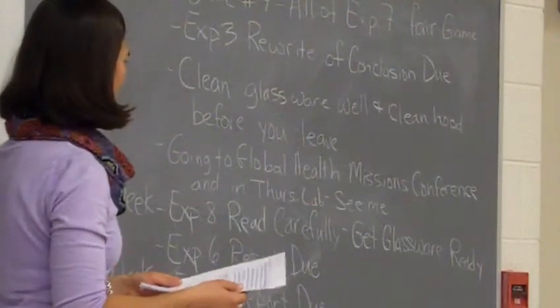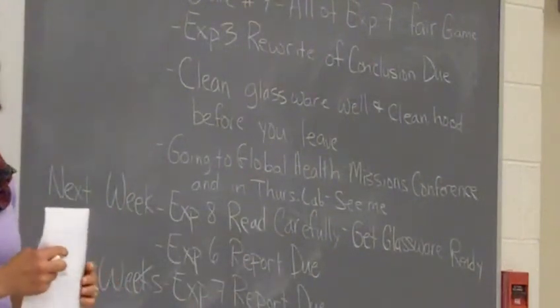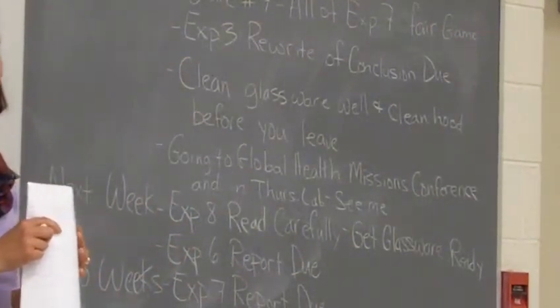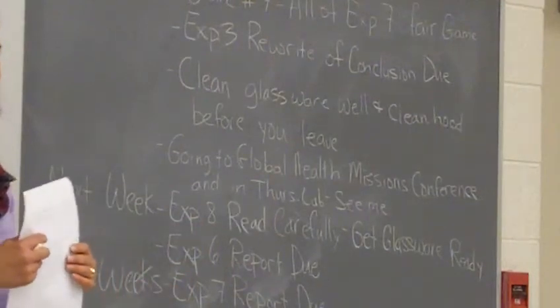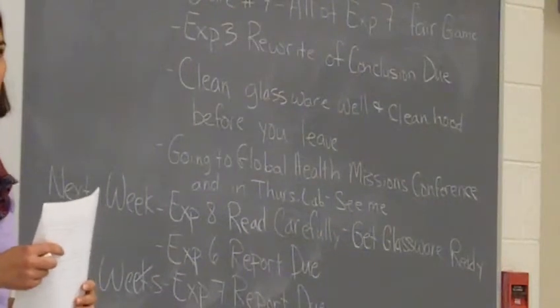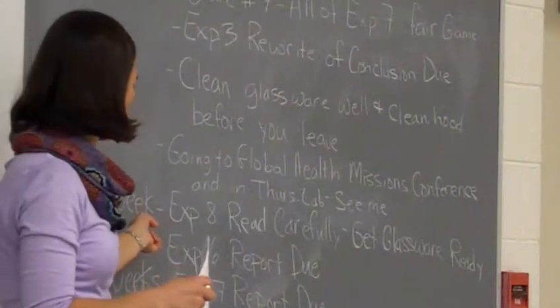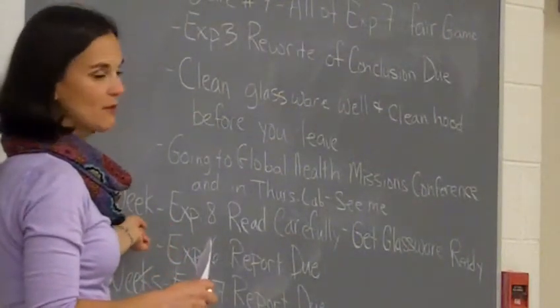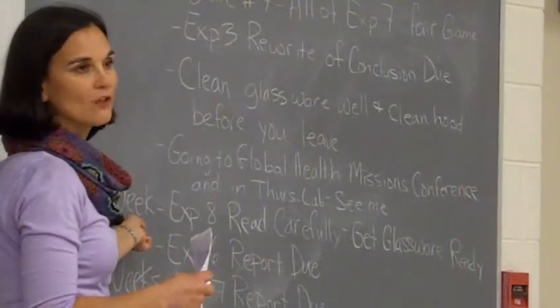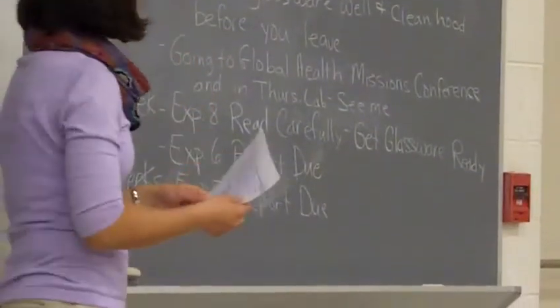Next week we'll be doing experiment 8. This experiment is a lot like experiment 3 in that there is a lot to be done, and it is very important that you follow directions exactly as they are written in the lab manual, okay? So make sure that you read it carefully before you even come to lab lecture next week so you know what is going on in the lab. Make sure you're well prepared for the lab. We're going to have to put some glassware in the oven next week, so the morning labs and afternoon labs will be opening even earlier so that can happen before lab starts as well. And I'll talk about that glassware here in a minute.